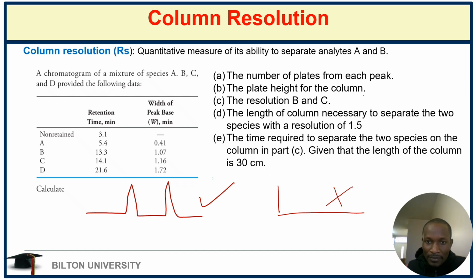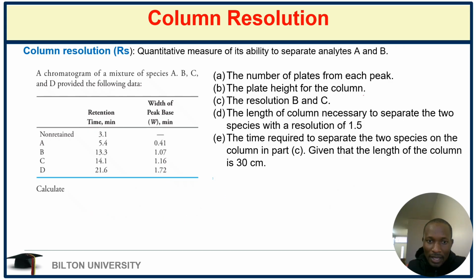However, any good separation should have a good column resolution, which means the ability of the column to separate two solutes from each other, and not only separating but to have proper separation and efficiency that's going to give us better baselines. So let's look at an exercise here, which is going to help us flash back to what you have done.